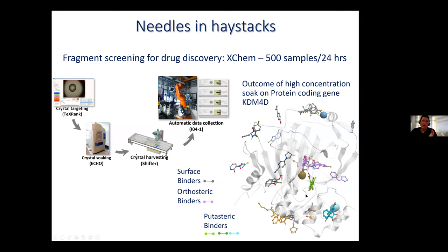And what that requires in principle is to be able to take multiple crystals of the target molecule and expose it to libraries of these potential fragments of drugs, this so-called fragment library. So typically what you want to do is solve hundreds of crystal structures where each structure is the biological target plus individual trial molecules that might be ultimately the building blocks of your drug. So this fragment screening process requires high automation. It requires, first of all, selection of, and here's the process, the target biological molecule grown as single crystals.